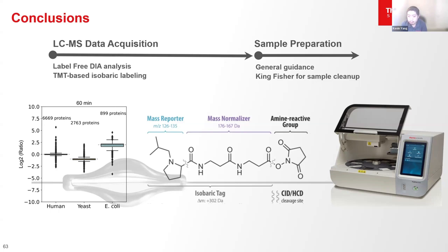I like DIA-NN. The downside is you need to be familiar with data analysis, because you get a single TSV output from DIA-NN that gives you the intensity of different proteins, so you need to know how to process those data. Spectronaut is somewhere in between. It has a good GUI and it helps you visualize your data, but it's not free. So to me, it sits between DIA-NN and PD with Chimerys. With Chimerys on PD, you can do a lot of data visualization and extraction. With DIA-NN, you can do anything, but it's free and very fast. And Spectronaut is in between these two.